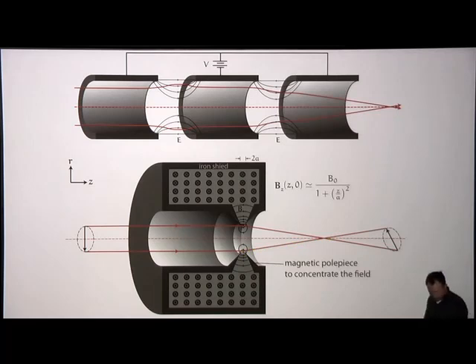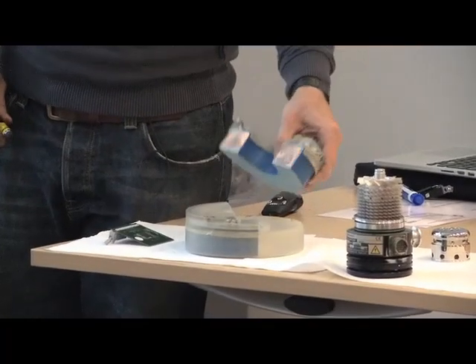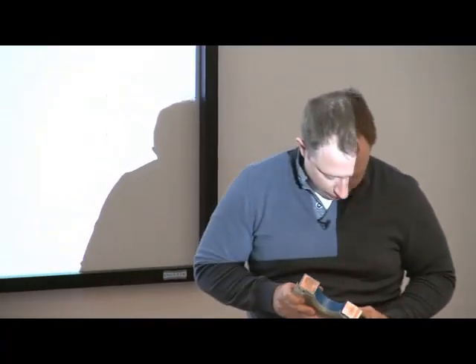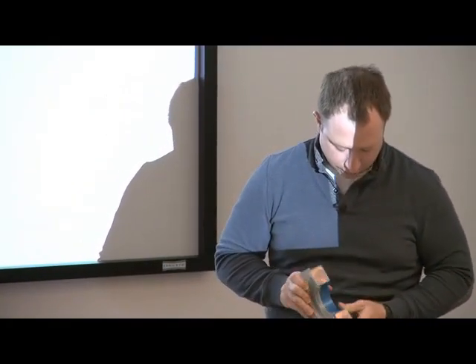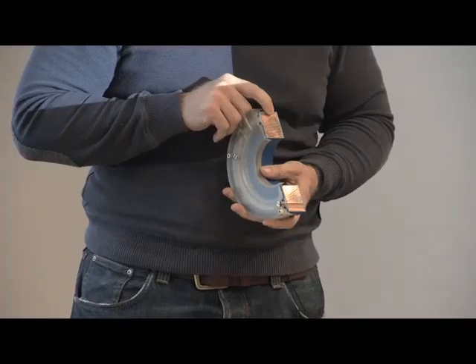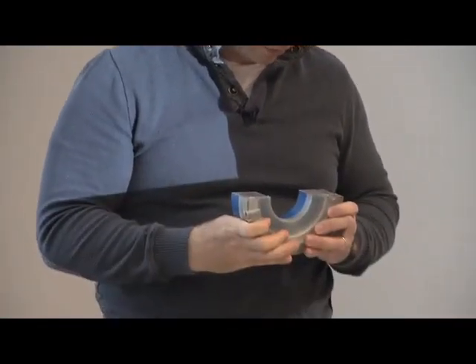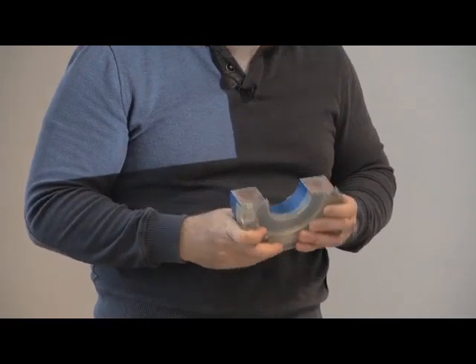And I actually have an objective lens from an electron microscope here. This is an old one from one of our old microscopes, which died, so afterwards you can take a look here. You can actually see the copper coils. You can see the dimensions. This is how big a real electron microscope lens is. This happens to be from the F30, or was from the F30. Obviously it doesn't work anymore.